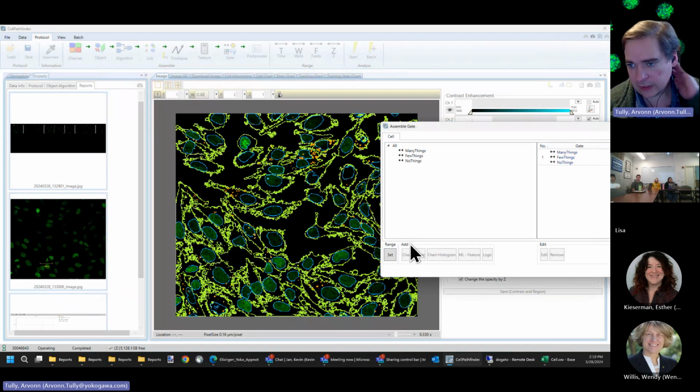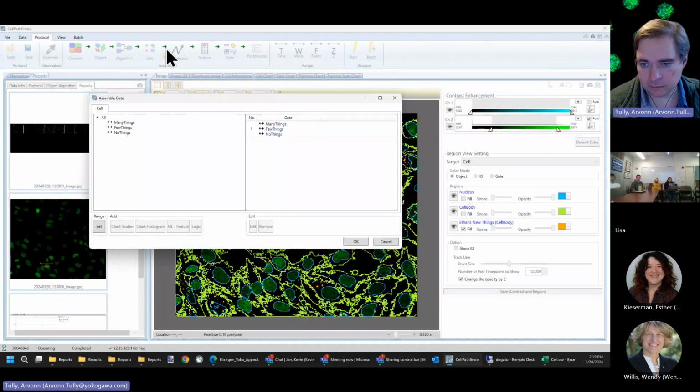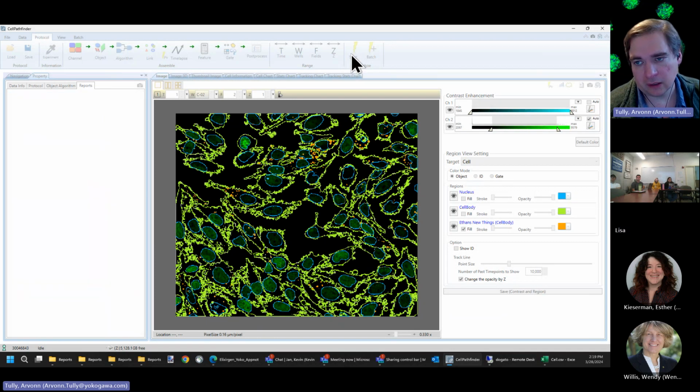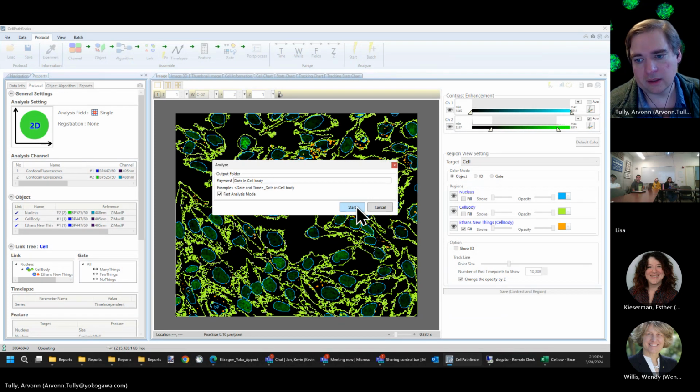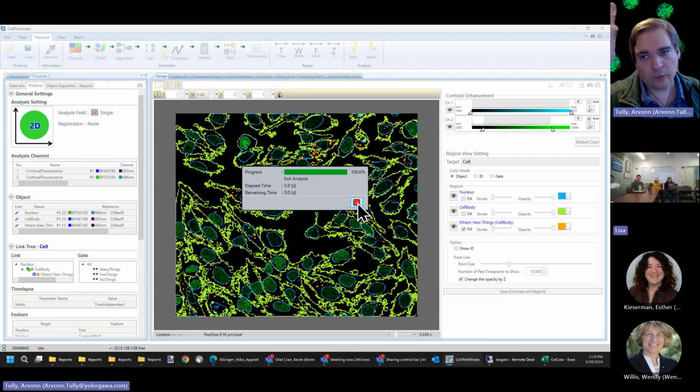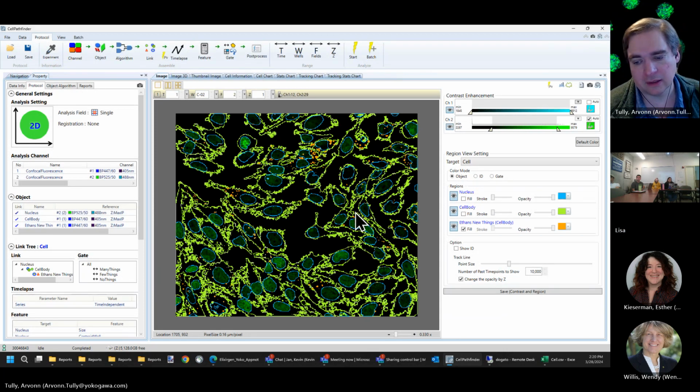So now the only catch with this labeling is that it is not applied until you hit the start button. And so everything you've done up until now was a preview. It gets saved in memory. It's not actually written to disk. It's not saved anywhere. When you hit start, it actually saves it to disk.